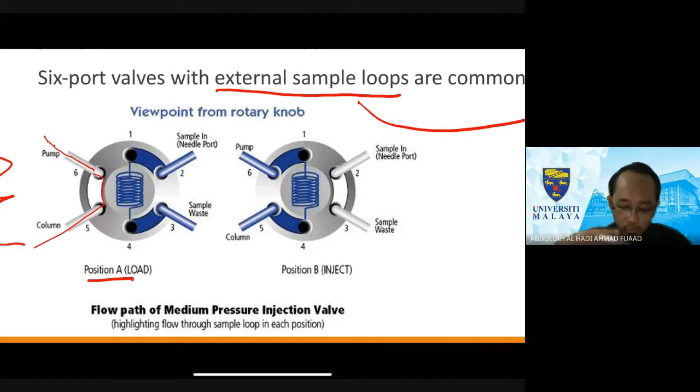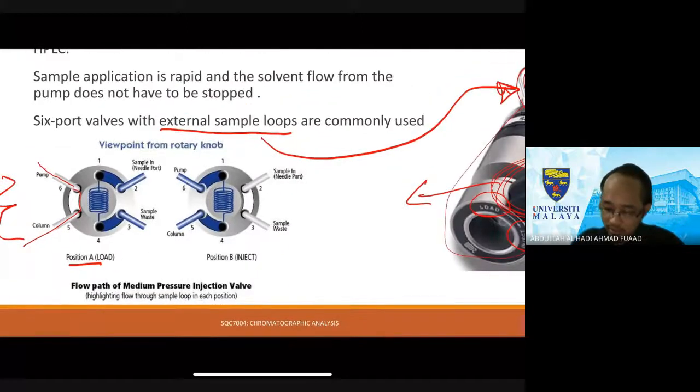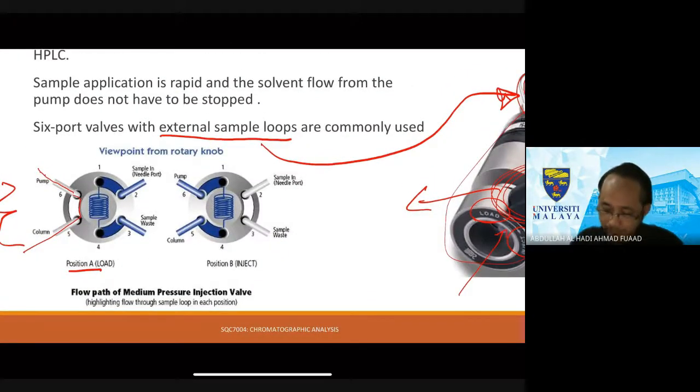In this load position, you take your syringe, stick your needle into that hole over there, and then inject.